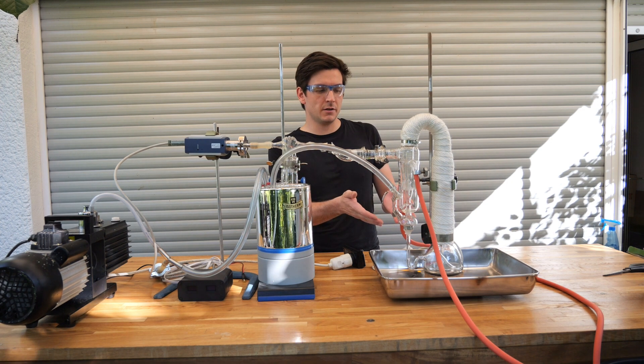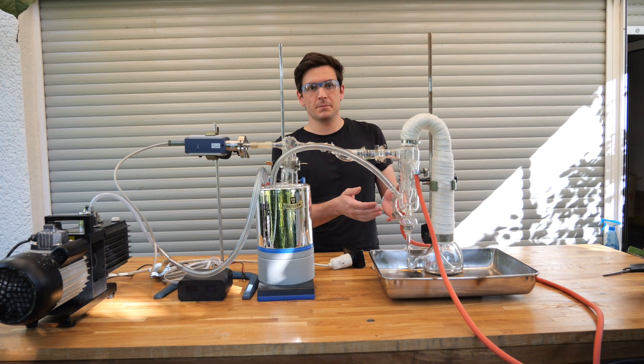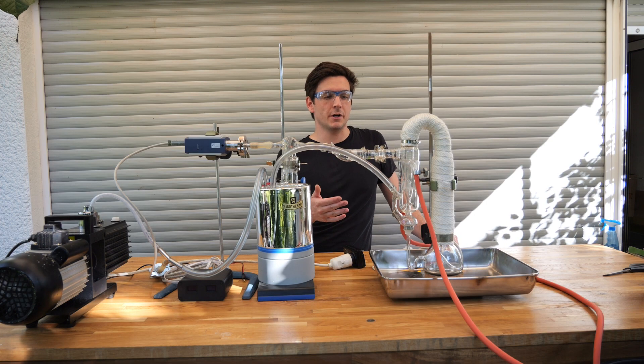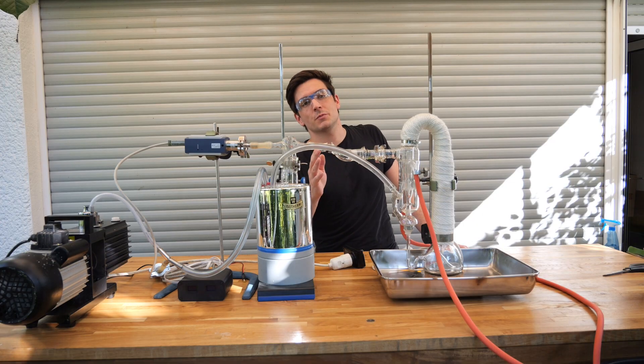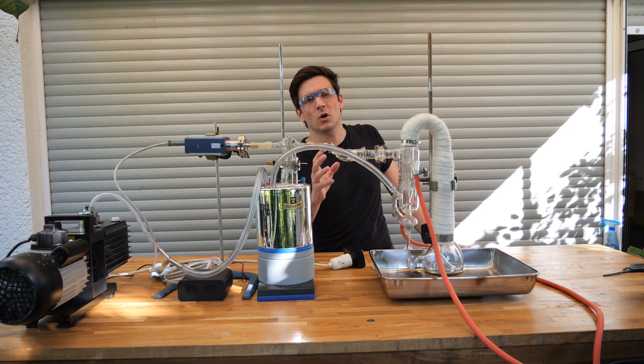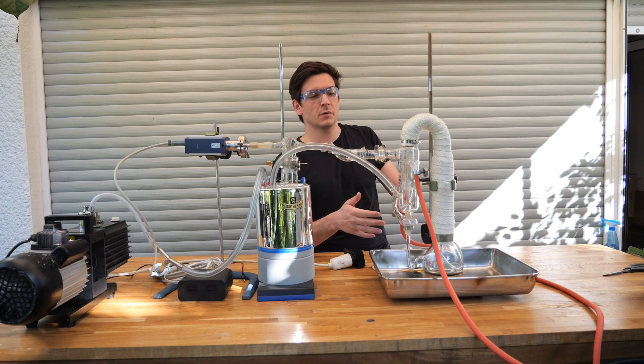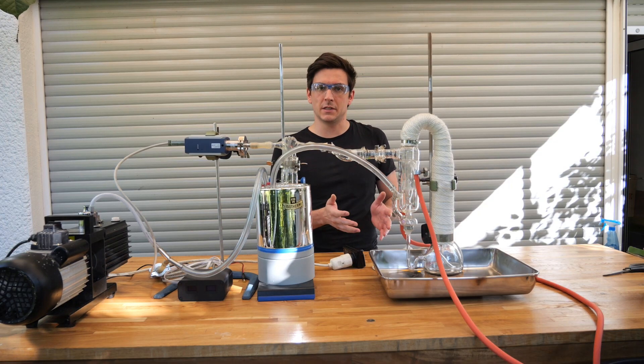This one you see right here is a mercury diffusion pump. If you're interested in how these pumps work, they are fascinating. They work without any moving parts at all. You can watch my video I made about one year ago where I explain the working principle of this type of pump in detail.